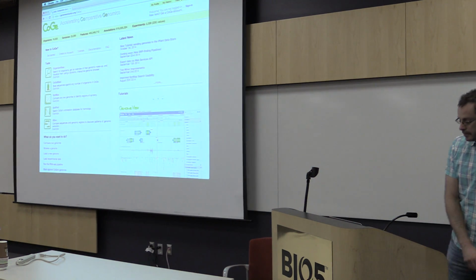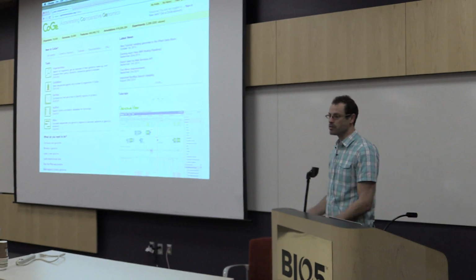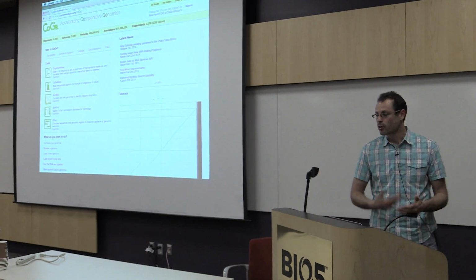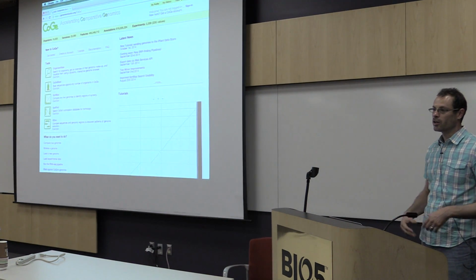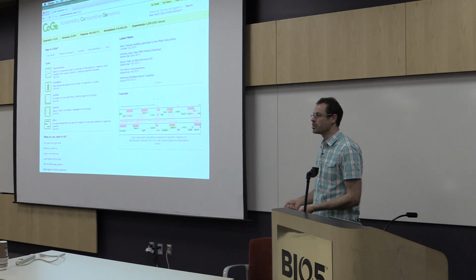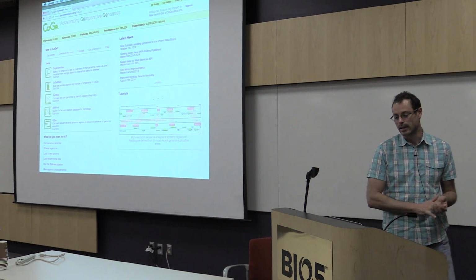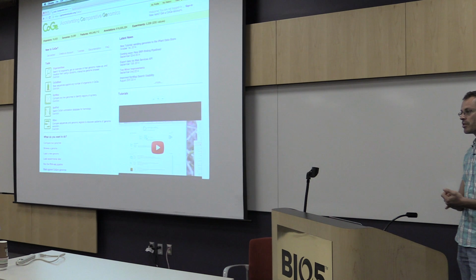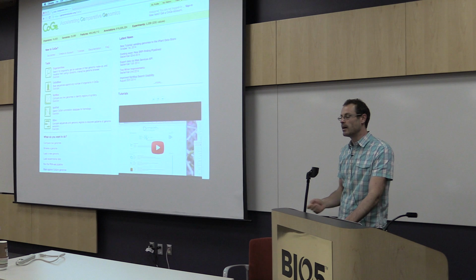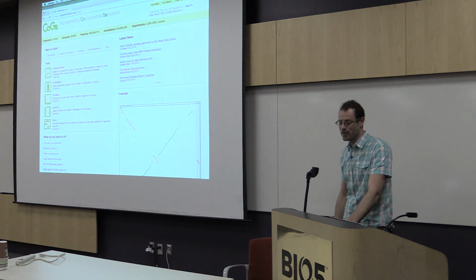Over the last year, one of the big pushes with this platform, which lets you do all sorts of fun stuff with genome analysis, has been incorporating what we'll call quantitative genomic data, so the ability to do measurements and associate them to a genome. These are things such as RNA-seq, methylation patterns, copy number variations, and so on. And then we have other kinds of data associated with the genome, specifically around diversity. So SNPs, variants, all those kinds of good things.